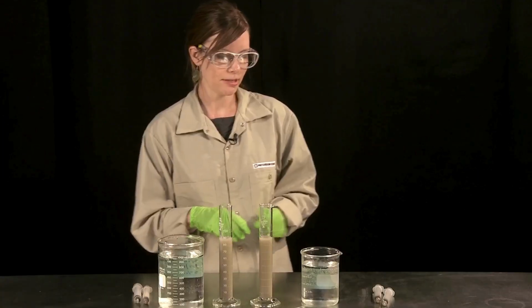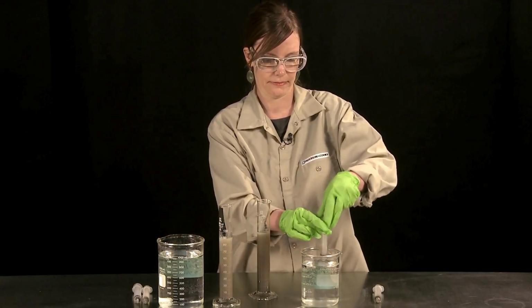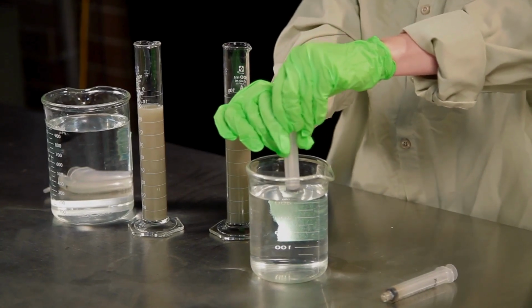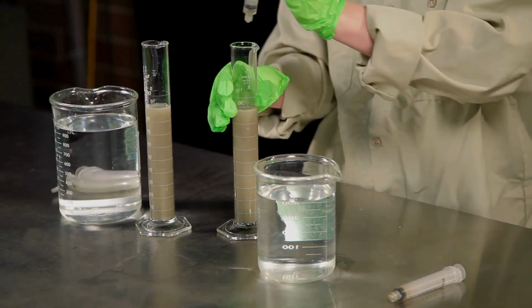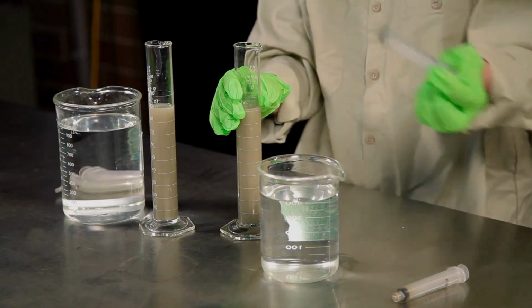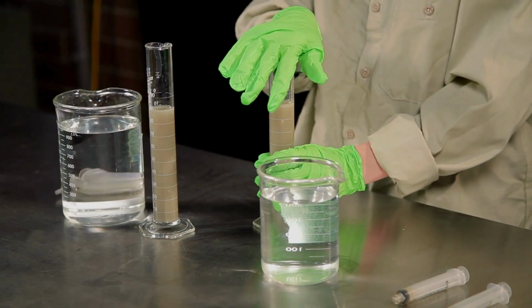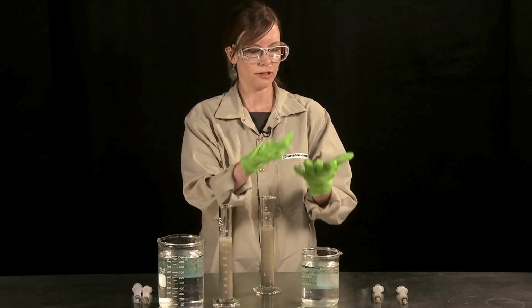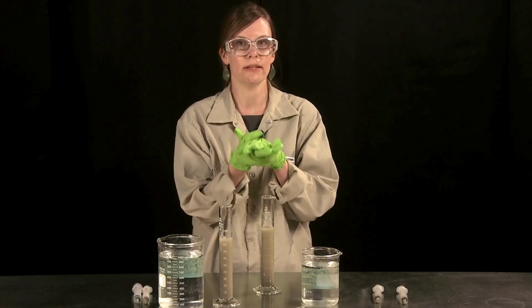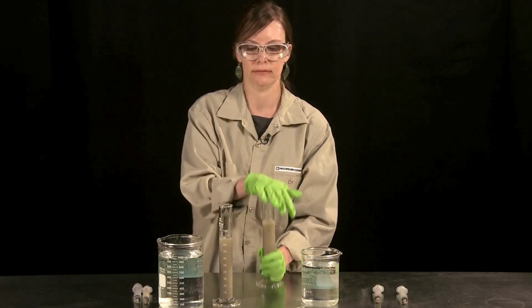So first of all, I'm going to add some flocculant to my slurry sample using the syringe. I'm just going to do about 1 ml. The cylinder is going to be inverted 3 times to maximize the mixing between the flocculant and the slurry material. I should also mention that gloves are recommended as PPE for this experiment to reduce the contact with the material.